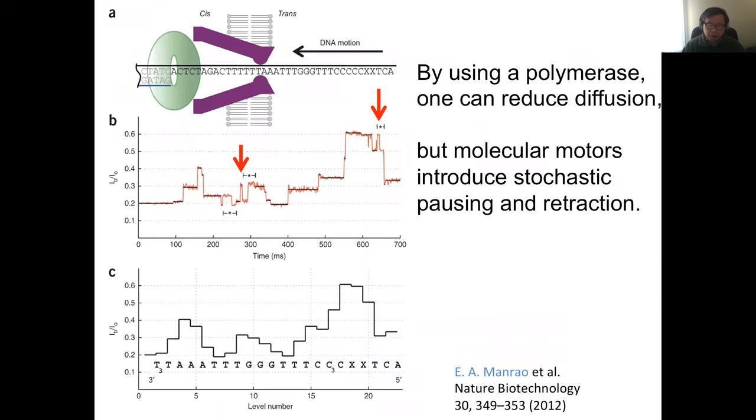And then everyone, by about 10 years ago, started to pay attention that there has to be a way to suppress diffusion. And so people, for example, the Washington group and in Oxford, added a molecular motor here, essentially to suppress diffusion this way. And then they started to see some information they believe, and I'm convinced there is some useful information.